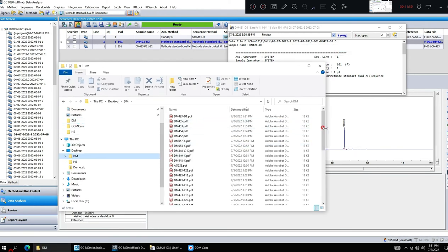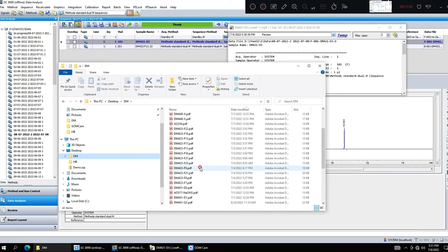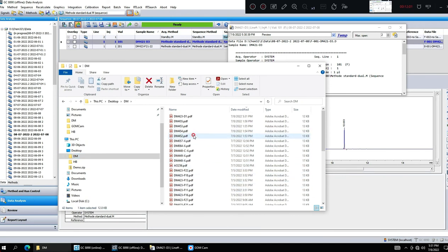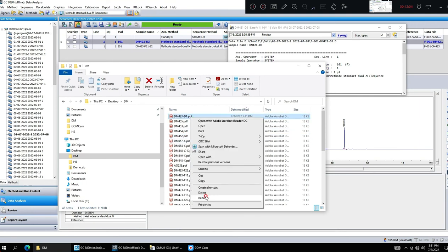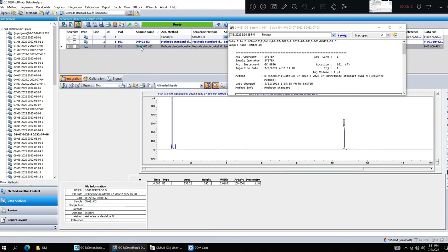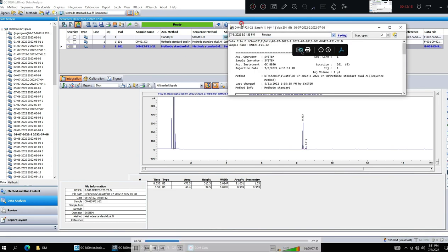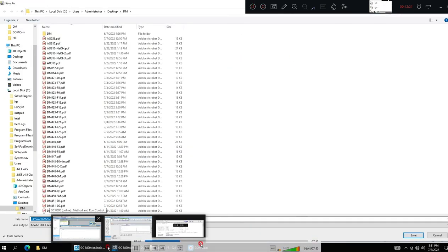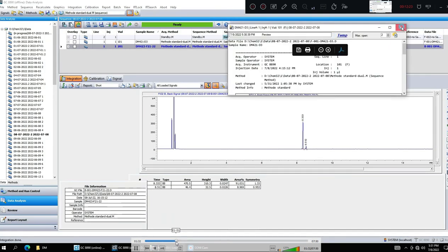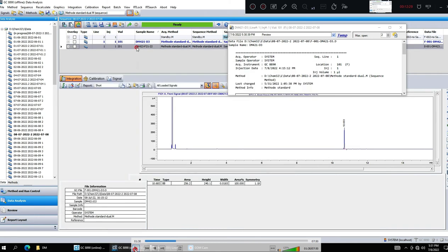Okay, so here an error was made. I indicated the wrong name, so you can change the name. Here it is. So let's rename that. Okay. And the other one, same procedure: review, print report. So you need a little bit of good memory because here you can change anything. Let's go back a little bit in the video.